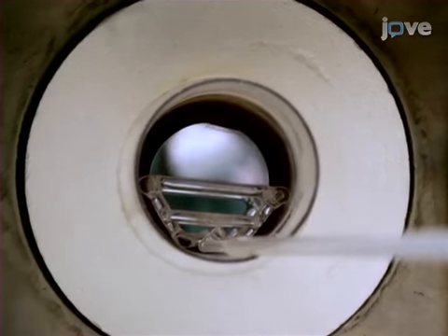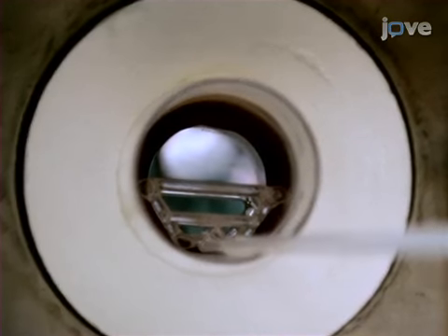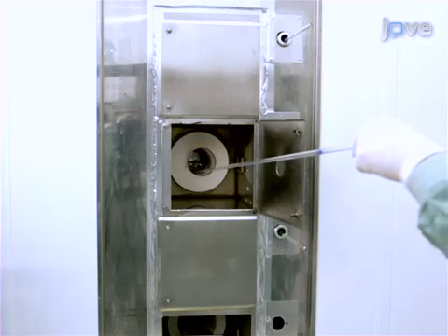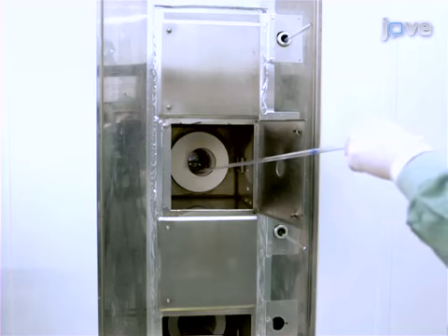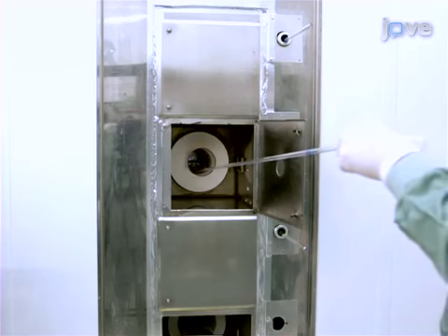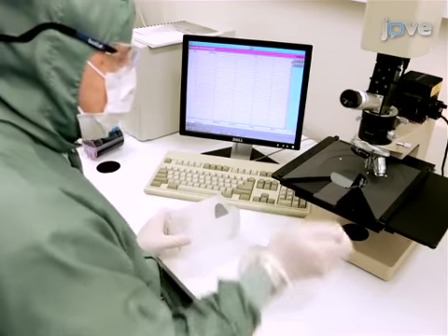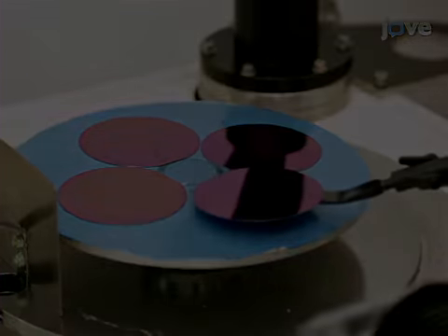Then, oxidize a silicon wafer in an atmospheric horizontal furnace at 950 degrees Celsius for 40 minutes to produce a 200 nanometer silicon dioxide layer. After that, confirm the thickness with a small spot spectroscopic reflectometer. Place wafers in vacuum deposition system.